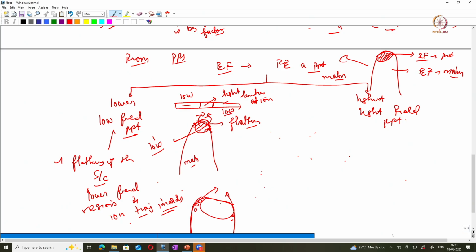This is due to the flattening of the surface because of the low field precipitate present in the matrix. If the evaporation field required for the precipitate is lower than the matrix, the precipitates will field evaporate very easily. So the evaporation surface gets flattened, due to which the atoms in the matrix get deflected inwards, and you will get a very high density of ions just above that precipitate.